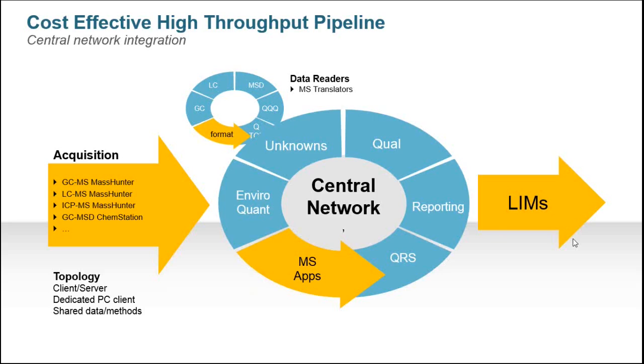Is it true, PDF digital signatures or PDF type image? So that's Adobe technology. Adobe uses the word digital signature very loosely, so I have adopted that. They consider the bitmap image that I showed as a digital signature. So no, that is not what I'll call a certified digital signature where you set that up. There's a lot of overhead in doing that. That's a much more sophisticated approach than what I showed you. I showed you a low-cost, cost-efficient manner where somebody would just denote that they had finished doing the report. It's really just simply a bitmap.